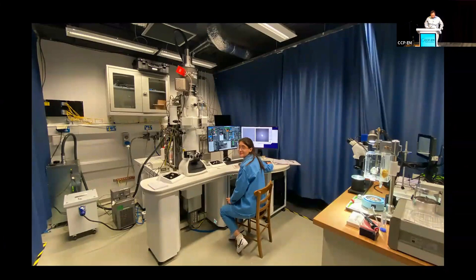And it fits in a nice little room. This is only about 3 by 4 meters big, including everything. And you can see we have a manual plunging unit here, which we make in the workshops at the LMB. And these have now been commercialized. And you can even look at your grid just after you've plunged it with a dissecting microscope, put it in the microscope column, have a look, take it back out again, and make another grid within a short period of time, maybe 10 or 15 minutes. Usually we go for coffee and then come back and then do another one or something like this.